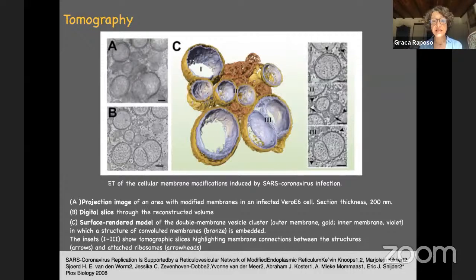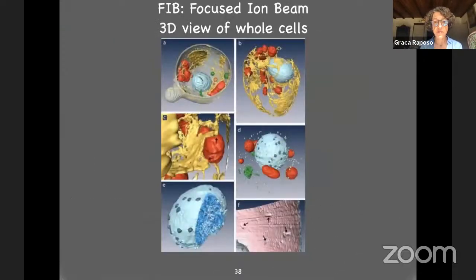This is from 2008, but we are still in the COVID period all around the world. I wanted to give you an example of a paper made during SARS-1, by the way, where they already used electron tomography in viral cells to study the importance of the endoplasmic reticulum in cells infected by the coronavirus.